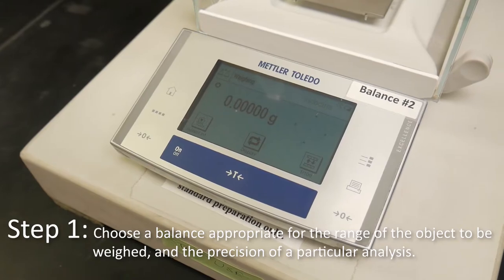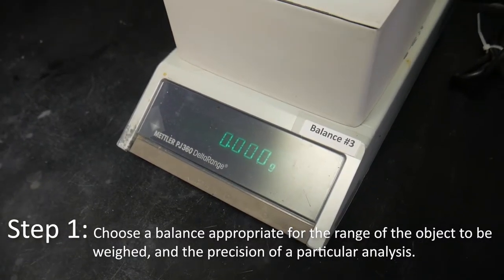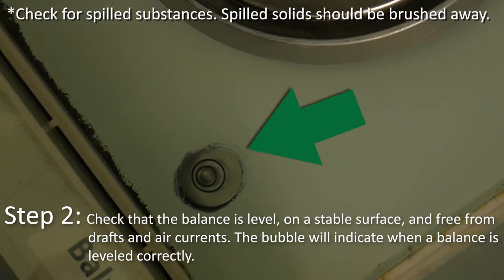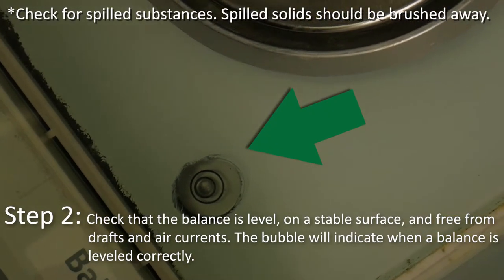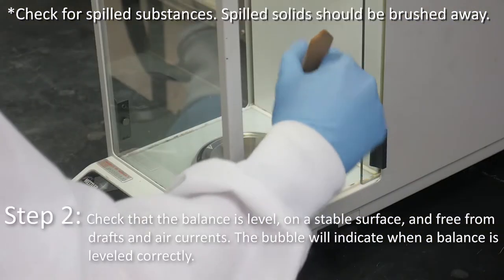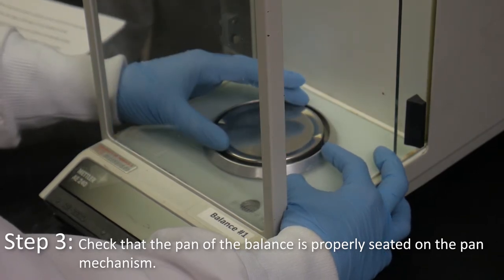Choose the balance appropriate for the range of the object to be weighed and the precision of a particular analysis. Check that the balance is level on a stable surface and free from drafts and air currents. The bubble will indicate when a balance is leveled correctly. Check for spilled substances — spilled solids should be brushed away. Check that the pan of the balance is properly seated on the pan mechanism.